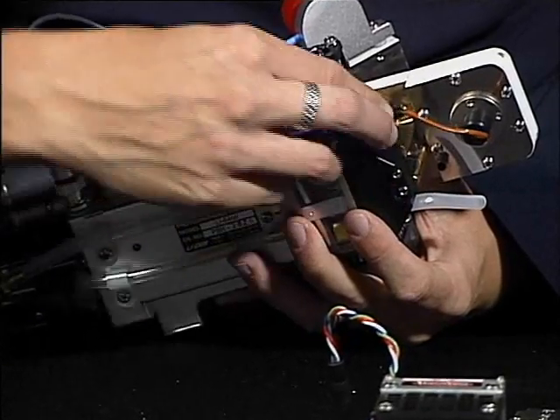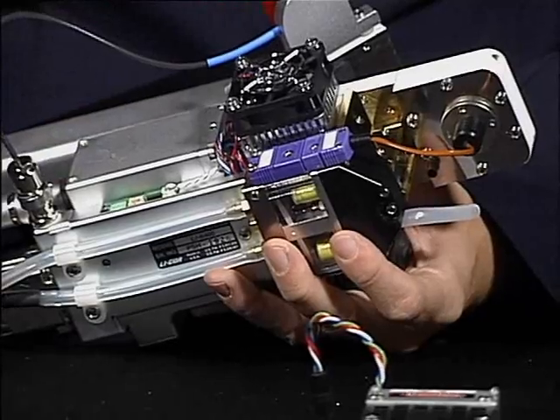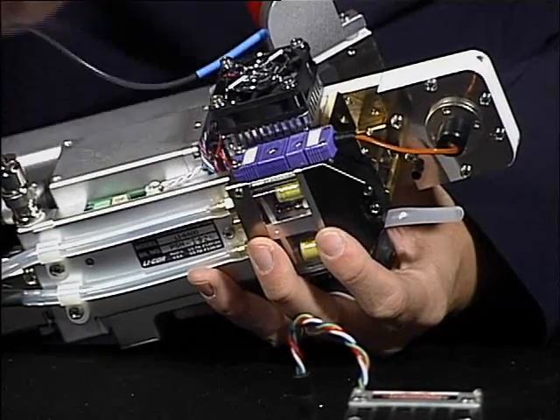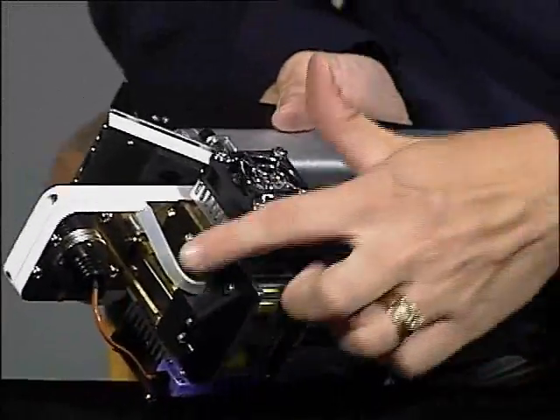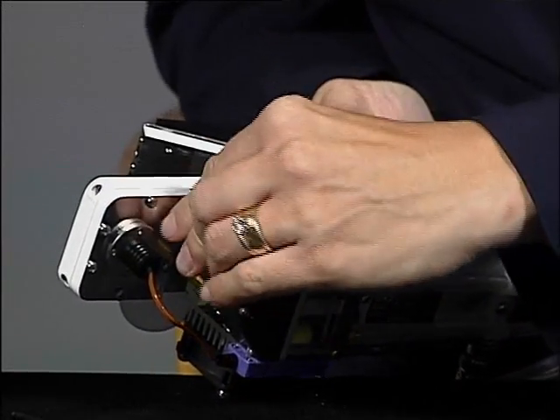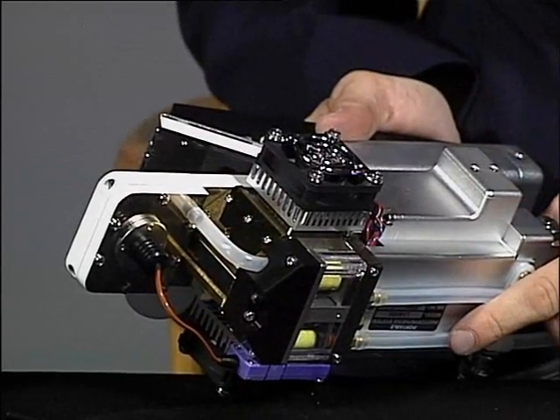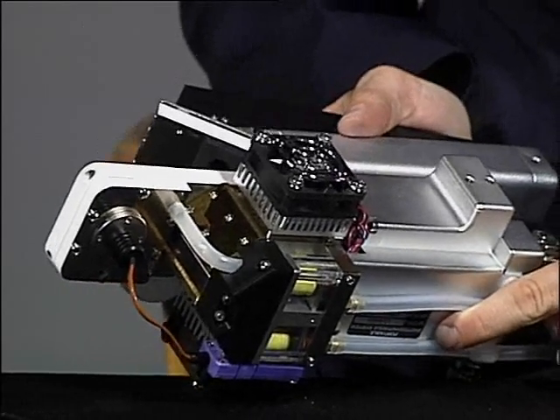And the thermocouple is keyed. There is a positive and a negative side, and there's also one prong is slightly larger than the other, so you should be able to plug it in without turning it backwards. Next, we need to install our lower chamber exhaust tube and simply put it in the right position and gently press up. And the tube will go easily onto the hose barb.